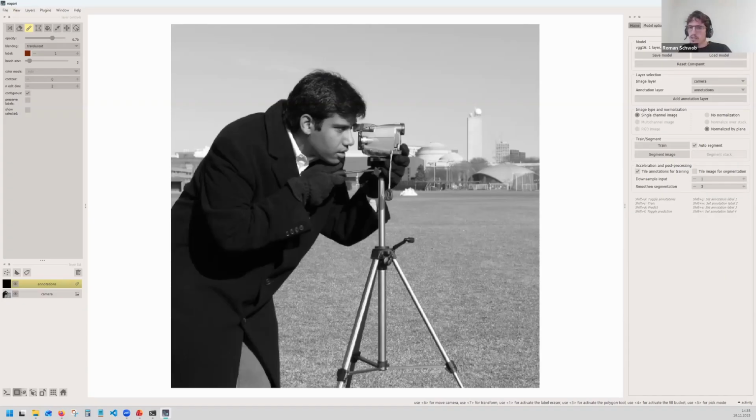I just got the question, can you share how many classes we should use, like the range? This is really a specific question about the task. Technically you can use any amount of classes that you want. You could try to say buildings, trees, grass, and eyes, nose, lips. This is possible. I don't think there's really a right or wrong. This is really dependent on the problem that you want to solve with your segmentation.